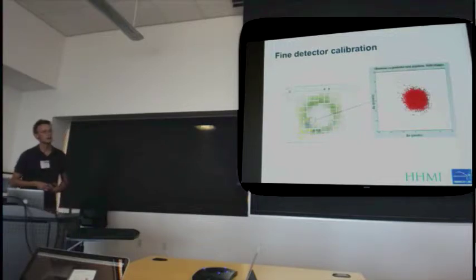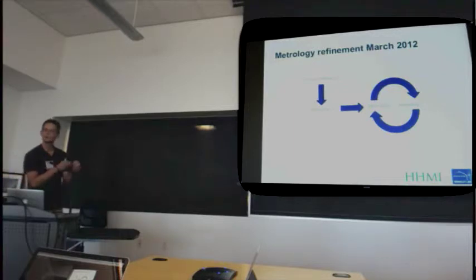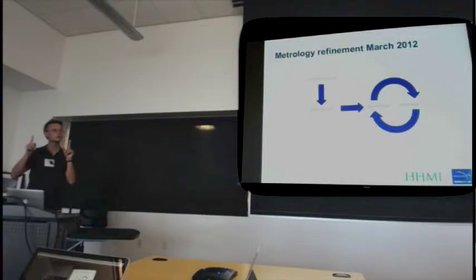And this really allowed us to not just index and process stuff at low resolution, but to push it towards high resolution. So the procedure that we had then was, starting from the initial metrology, basically what Slack, after they had done the measurements on the detector, would tell us was correct, we could nudge things around a tiny little bit and end up with a slightly refined metrology, and we could use that to do indexing. So indexing depends on metrology, and then we go back and determine new metrology based on predicted and observed spots. So then you've got the case where your metrology determination depends on indexing. So it's really circular dependencies.